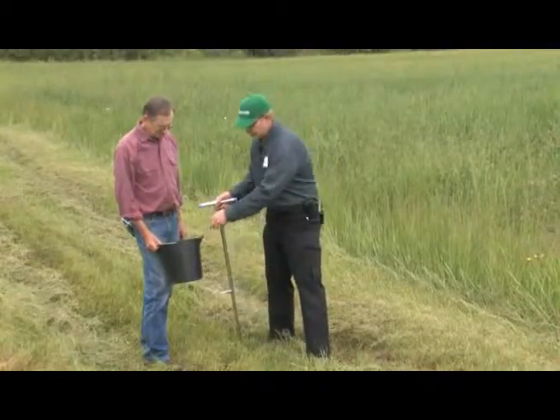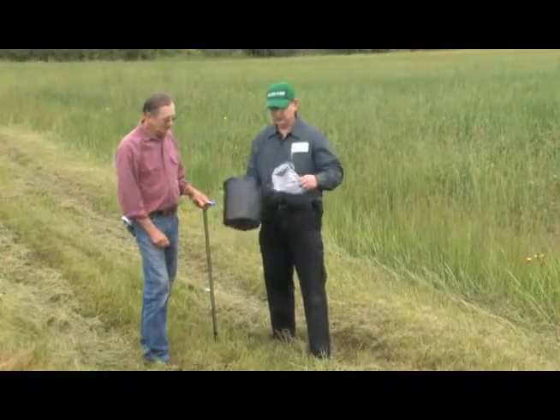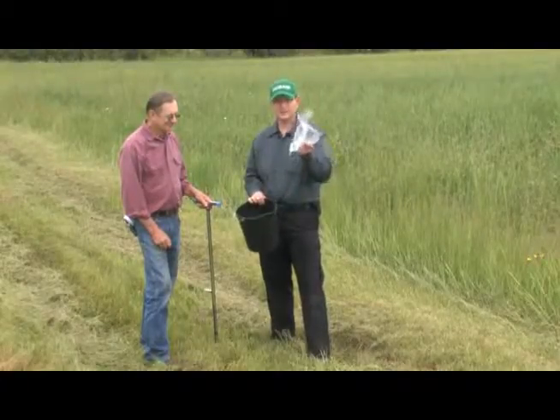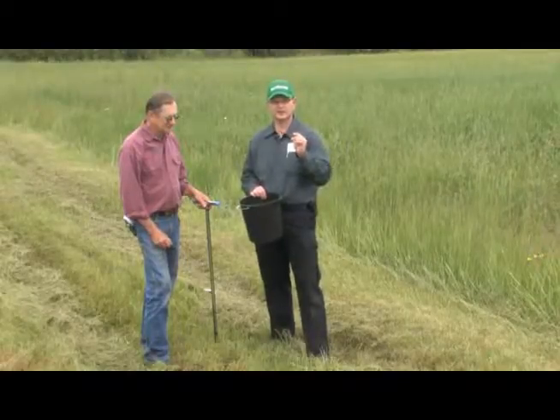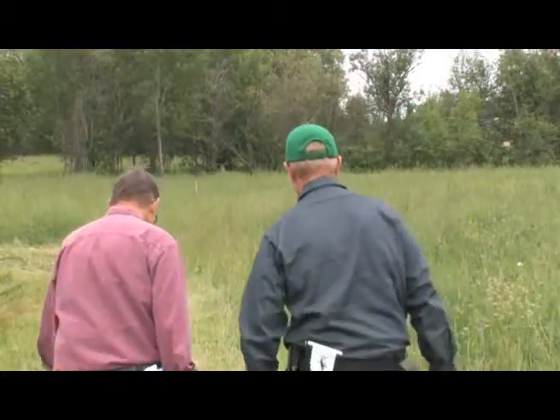Other items that you may find useful, and you should have in your arsenal, of course, is a plastic bucket. Make sure it's clean, and then a plastic bag, and then also even a little stick to help push out the soil if it's a heavy, wet soil out of the soil probe. So Bruce, should we get started? Okay.